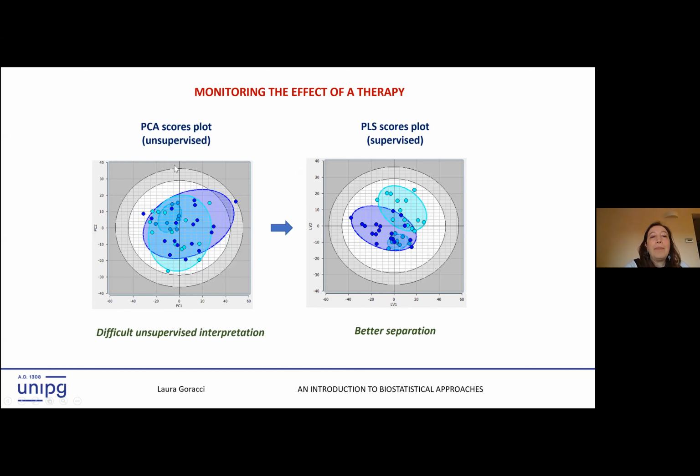But if I am in this first outcome, I can consider using a supervised method instead. This is not forcing the method in a general sense, because it could be that you really need to extract some information that is in other components of the PCA that are too far. But you will usually have a lower level of separation. Here, for example, the method was able to separate one of the groups, but the other two groups are actually collapsing in these two components, okay?